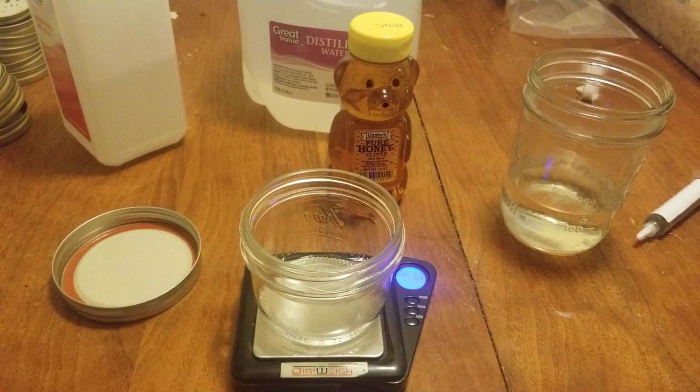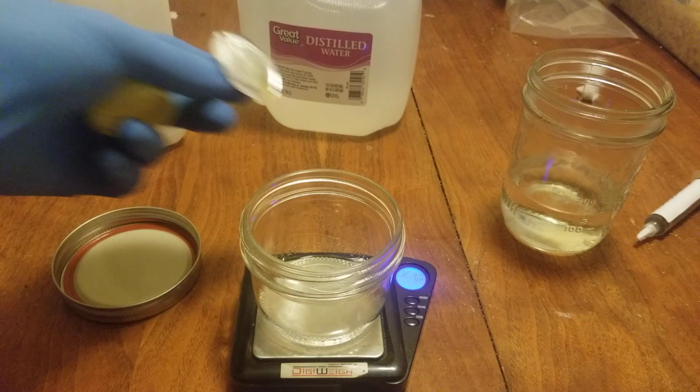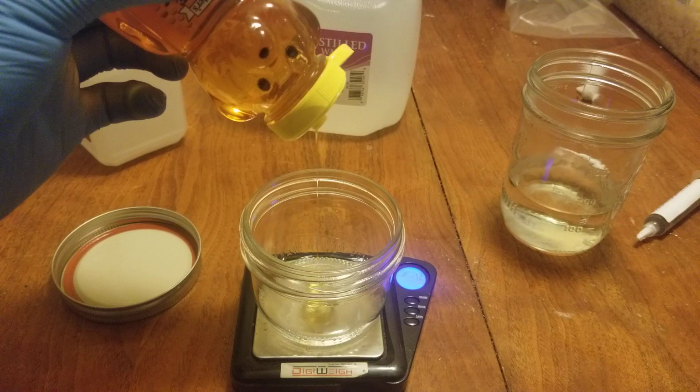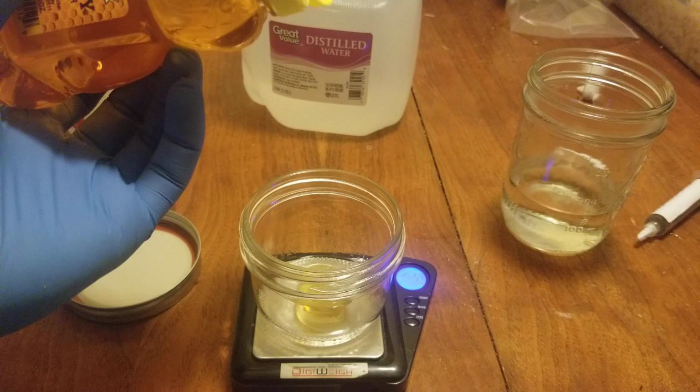Let's open this up. This is a brand new bottle of honey. I do have to peel this off. Oh, I love honey. Honey is amazing, very good for you, ladies and gentlemen. So let's grab our 6 grams of honey. I'm trying to watch the counter on it. I know you can't see it. It's important when you're doing this that you don't go over 10% of the threshold. That's why I'm not too worried if my math is off.